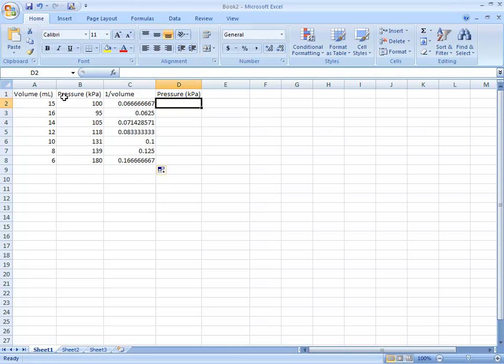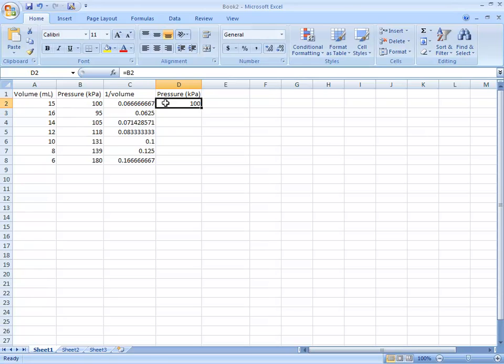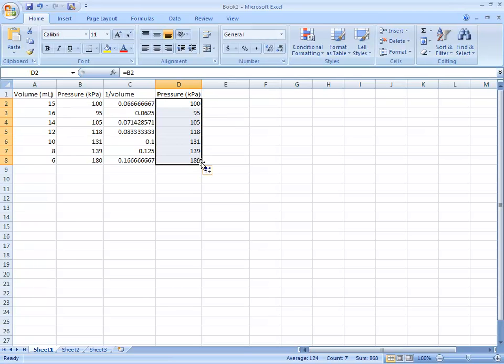The pressure column here is going to be the same. Press equals and select the pressure cell for that row, then do the same thing all the way down for all the pressures.